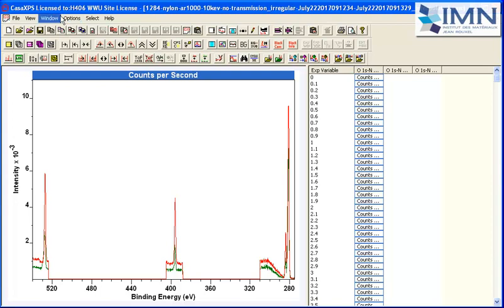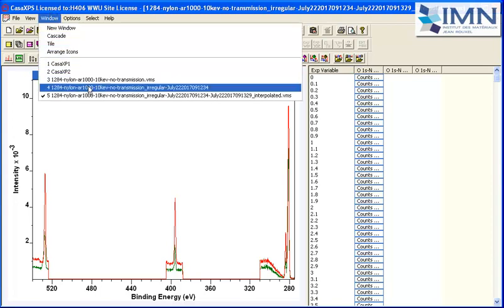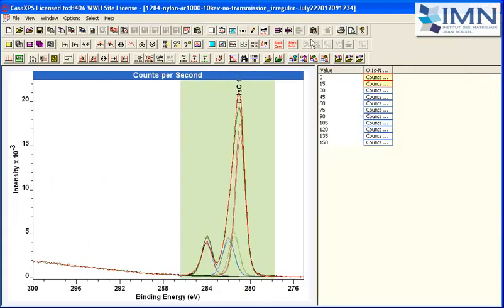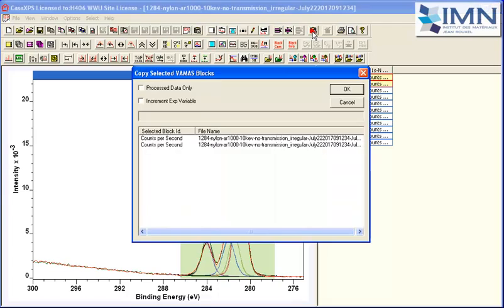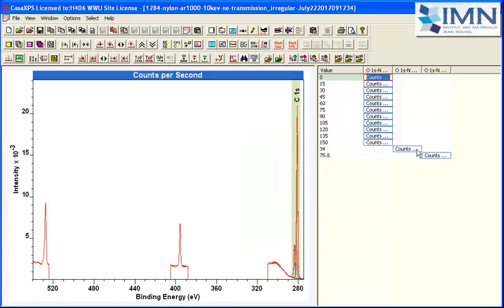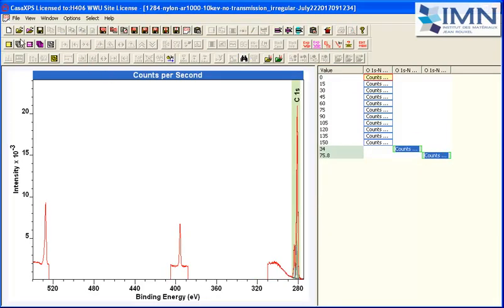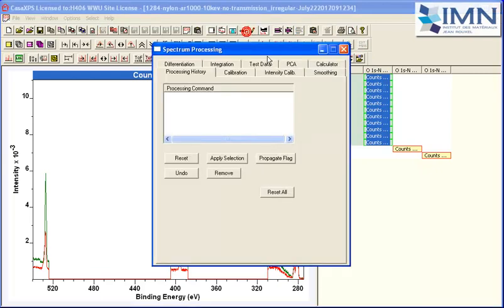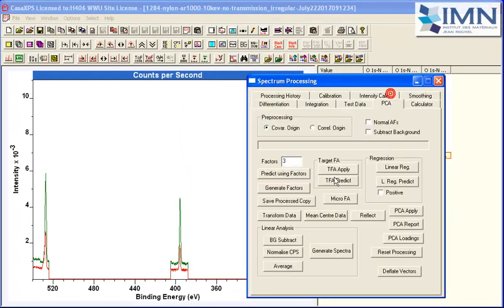So what we'll do next is go back to the set of merged oxygen, nitrogen and carbon, and we'll copy these two calculated spectra and overlay them in the active tile. Select the entire set of data that we constructed from the oxygen, nitrogen and carbon, and then using an option on the PCA property page we'll generate spectra.